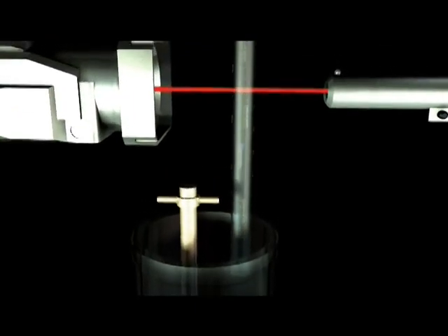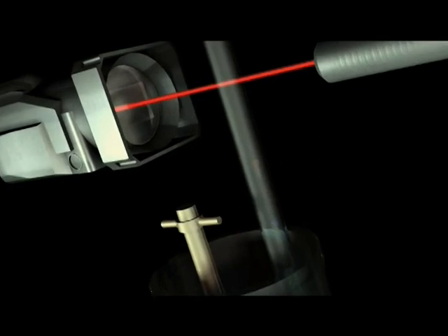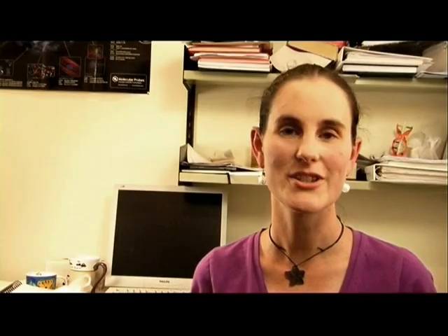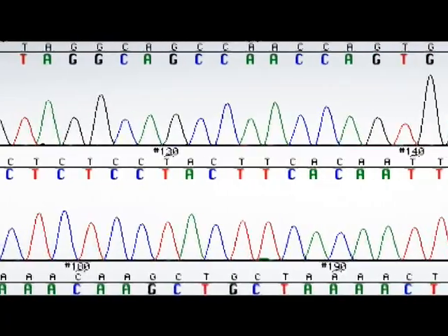The capillary and the electrode are placed in the sample and a voltage is applied. Because DNA has a negative charge, it will migrate through the capillary to the positive terminal at the other end — this process is just like gel electrophoresis. Smaller fragments will migrate through the capillary quicker than larger fragments. As they pass through the capillary, a laser excites the dyes, causing them to emit light, which is collected by a camera. Computer software converts the emission patterns into coloured peaks. This is called an electropherogram. It's possible to read sequences of up to a thousand bases with this technology. There are many things you can discover using DNA sequences; for example, we can identify gene coding regions or find mutations that cause disease. In our example, we sequence the mitochondrial control region. This piece of DNA is very variable, which allows us to detect differences between individuals from the same species. We use this to create a phylogenetic tree, which shows how related those individuals are to each other.